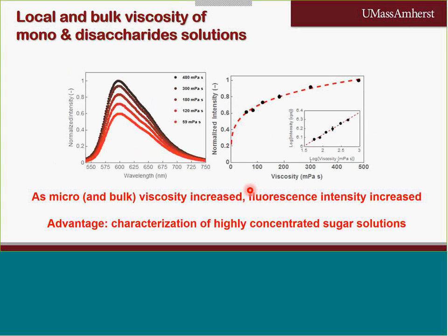So we dissolved molecular rotors in solutions of mono and disaccharides.